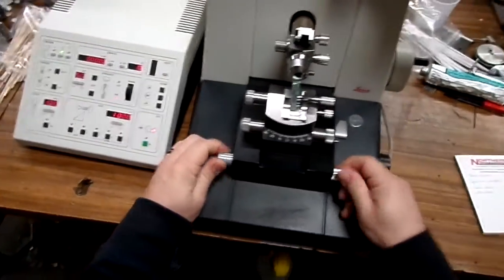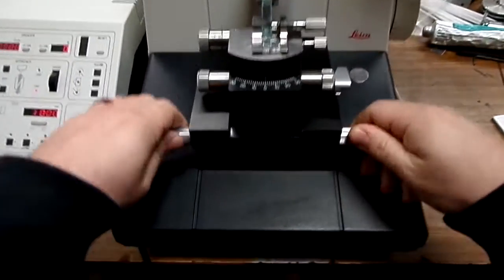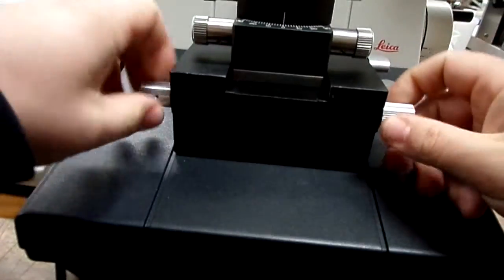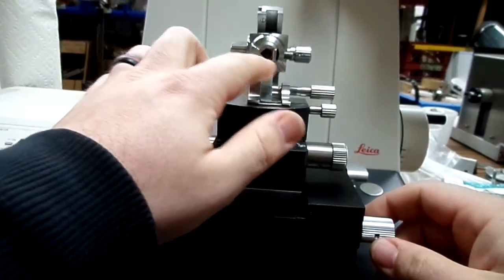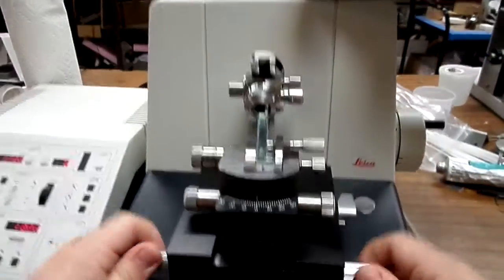So first of all, the base of the entire thing moves using these two pegs down here. Just rotate it and you can see the blade move next to it. You can see it move the entire thing side to side.